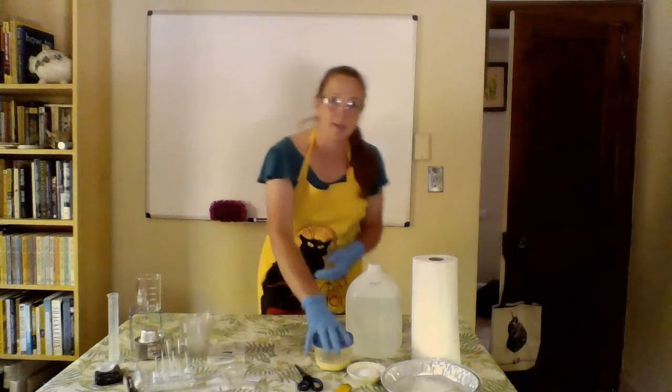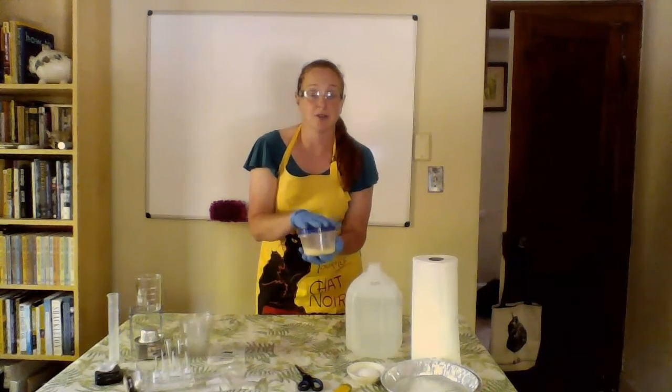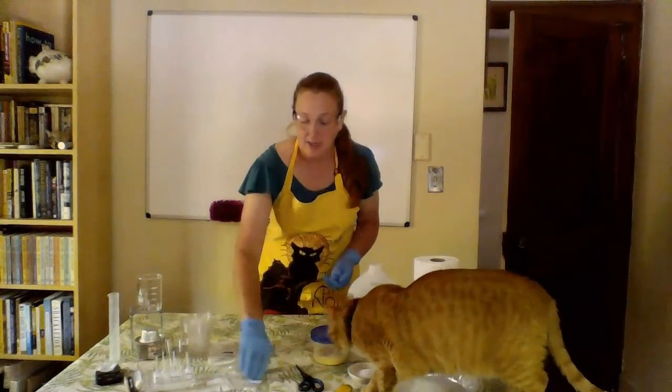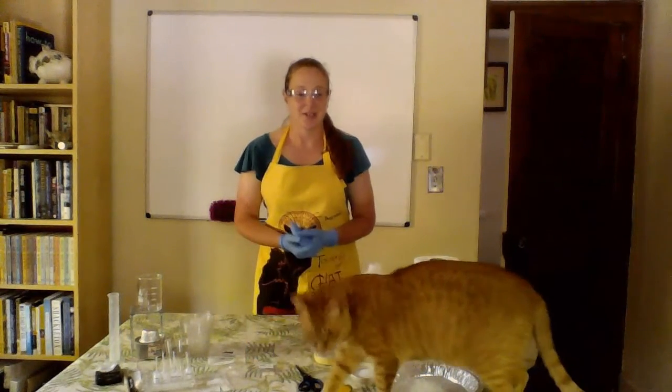So in today's experiment, it is absolutely crucial that the milk that you get is dairy milk. We want to make sure that that lactose sugar is in here so that when we are using the lactase enzyme, we can break apart that lactose sugar.